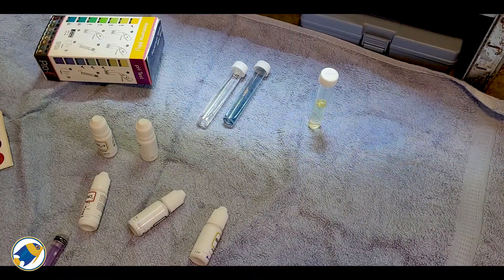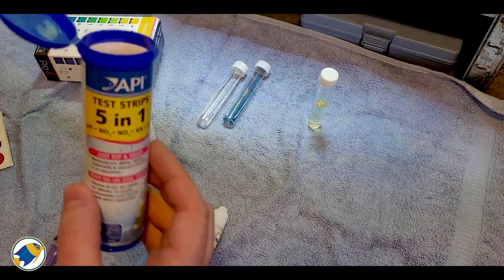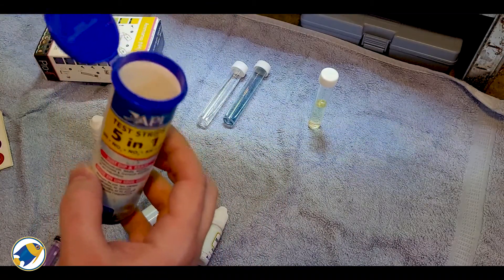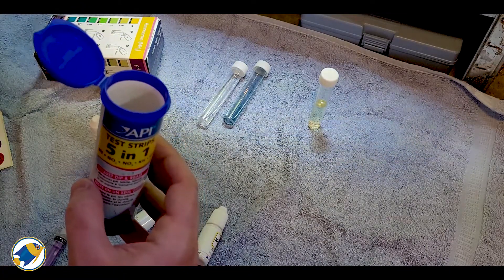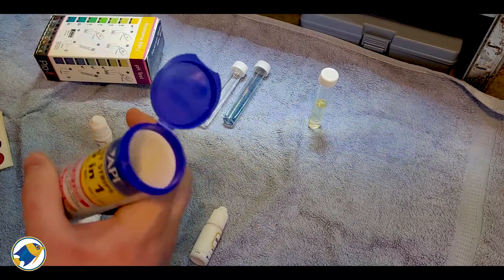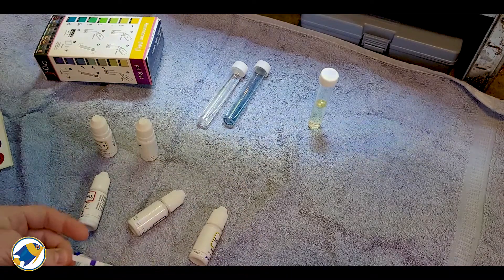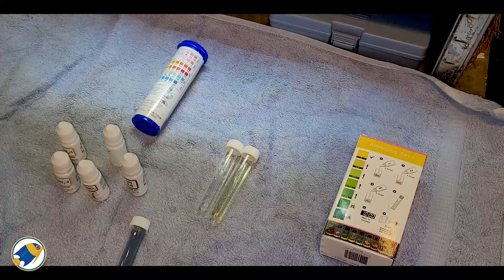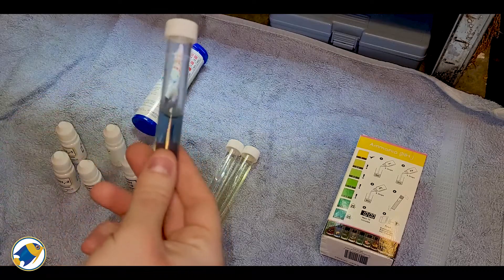Whilst we're waiting for our results from the liquid test kit, I'm just going to do a quick test with these API test strips that I purchased and see what kind of results we get from that. You can see how much quicker it is as well, because obviously you just dip the test strip in. We'll give it a few minutes.